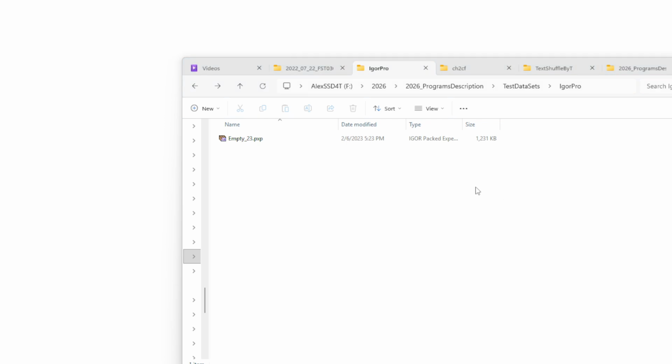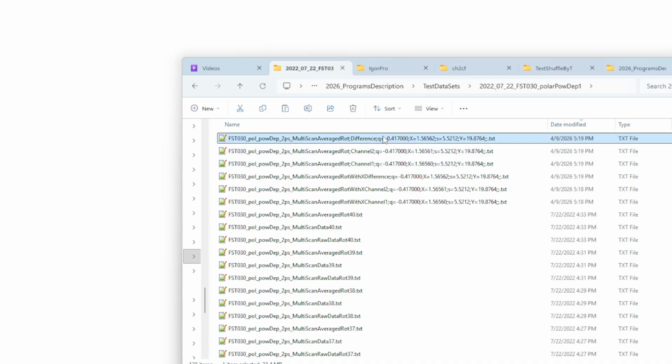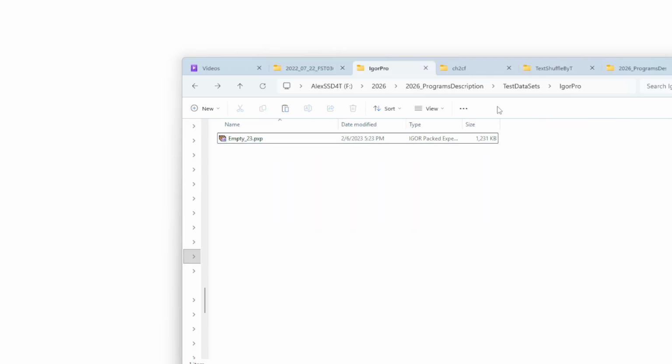In this video, I will show you how to use the IgorPro template and why we save the file without X, and why we have all of this long, additional naming for the IgorPro. So firstly, as a conventional practice, I usually prepare a separate IgorPro folder for all IgorPro files.